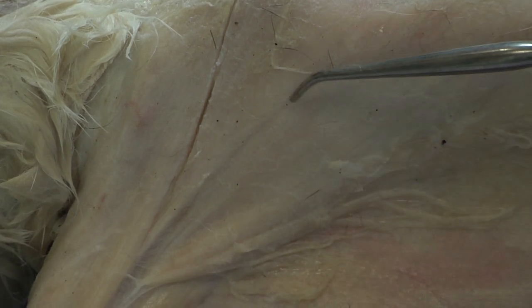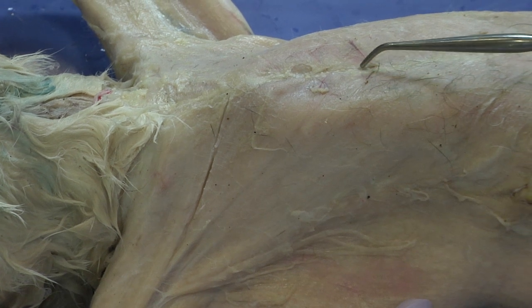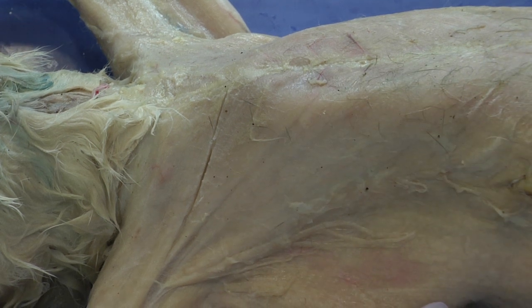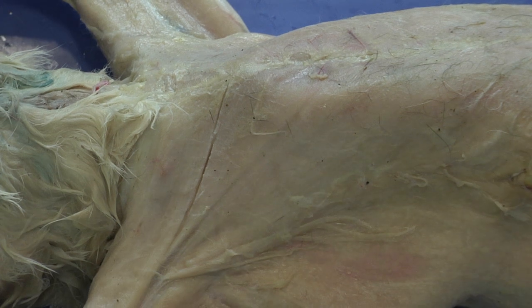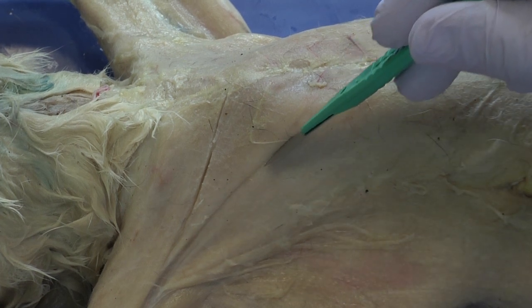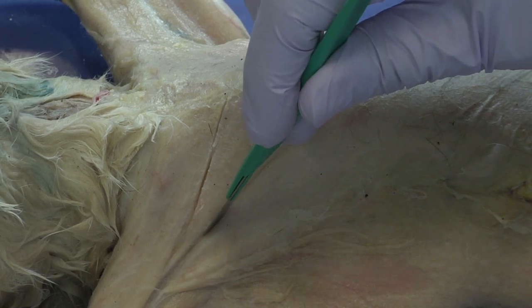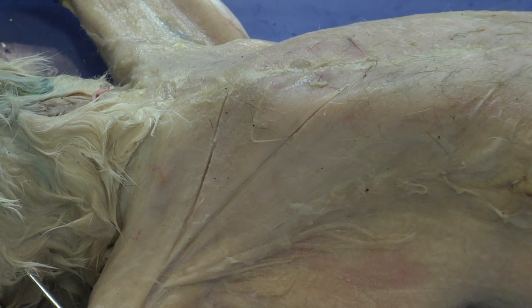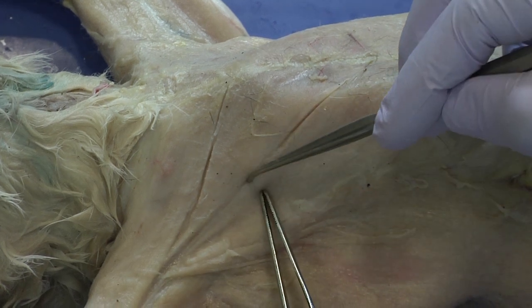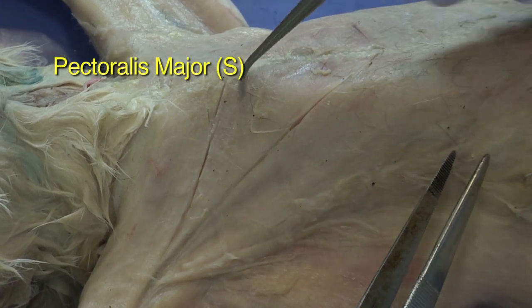If we follow that boundary all the way down, we see that it connects or merges at the sternum, or the midline, right around here. That's where I'm going to make my cut for the lower boundary of the pectoralis major. Just wanting to make smooth cuts, and you can begin to see what is clearly an isolated muscle — the pectoralis major.